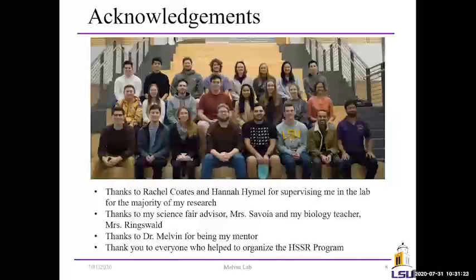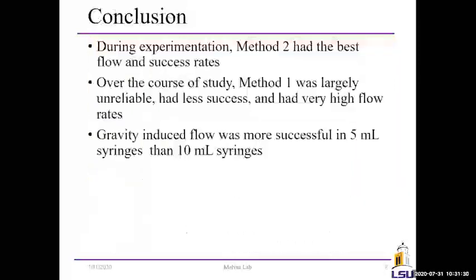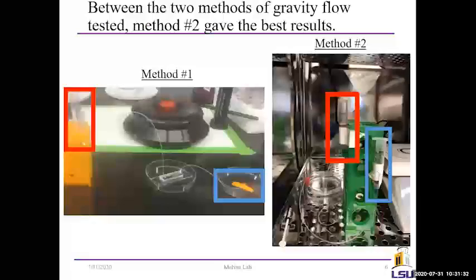Yeah, thanks, Margaret. It's a good presentation. I'm trying to understand the difference between method 1 and method 2. In method 2, it seems like you have a height difference to drive the flow. Is that correct? And then in method 1, you used another method?